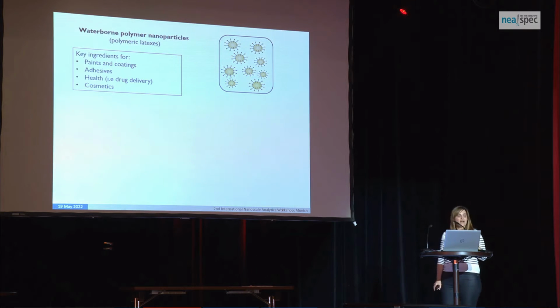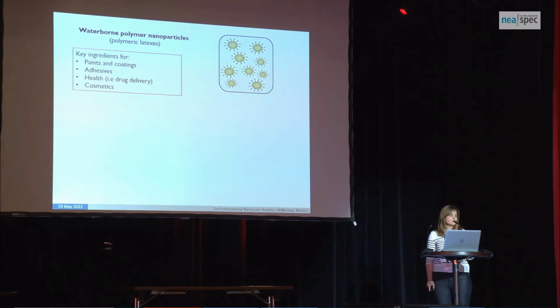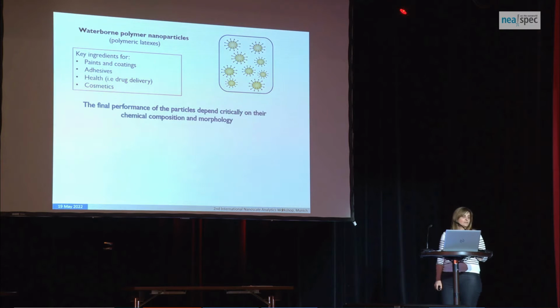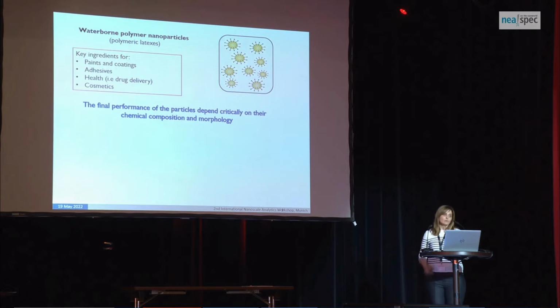And they have been substituted in solvent-based systems, and these water-based systems are now key ingredients for many industrially relevant applications, such as paints, coatings, adhesives, or cosmetics. The performance of these particles, among other factors, of course, critically depends on the chemical composition and on the morphology.